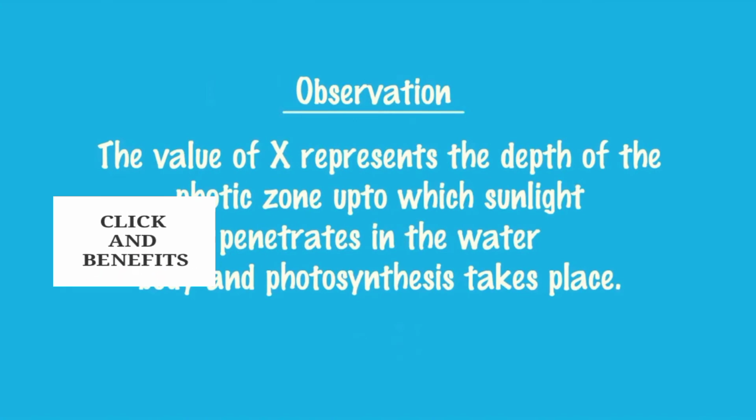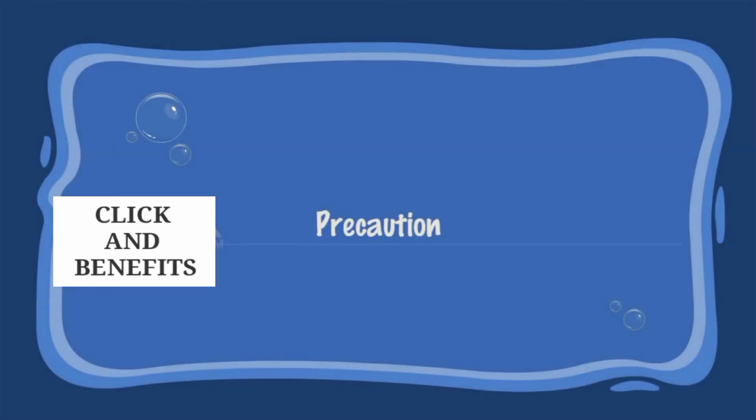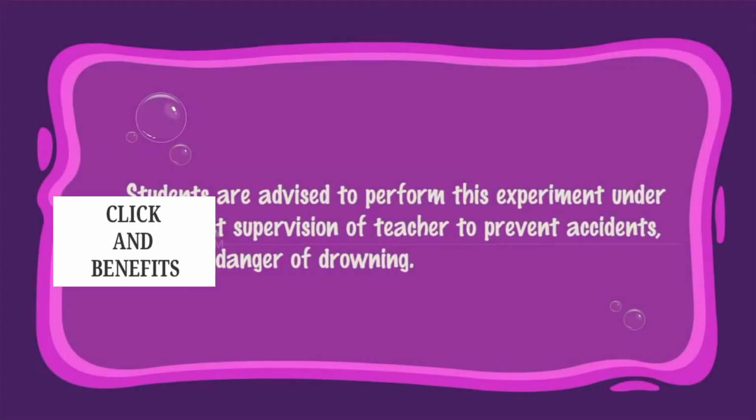and photosynthesis takes place. Precaution: Students are advised to perform this experiment under the strict supervision of a teacher to prevent accidents, including danger of drowning.